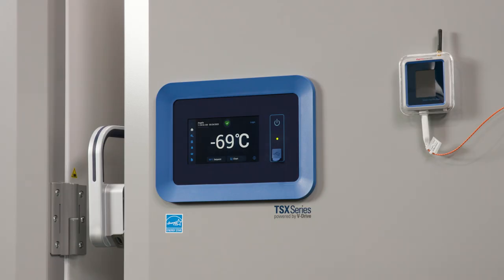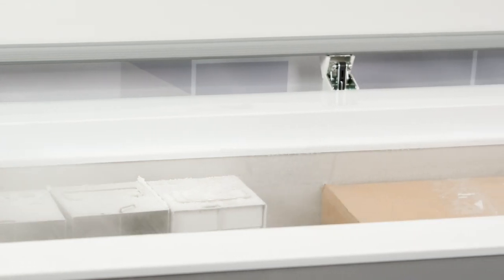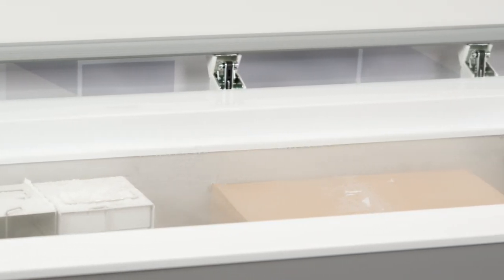Lastly, you should consider temperature recovery time. We all know that precious cold escapes every time you open the freezer door, which causes the freezer to warm up. This can affect sample safety if not kept in check. Even though both types of freezers have excellent recovery times when doors are left open for a minute or two, the horizontal orientation of a chest freezer helps trap the cold and promotes rapid temperature recovery and improved uniformity.